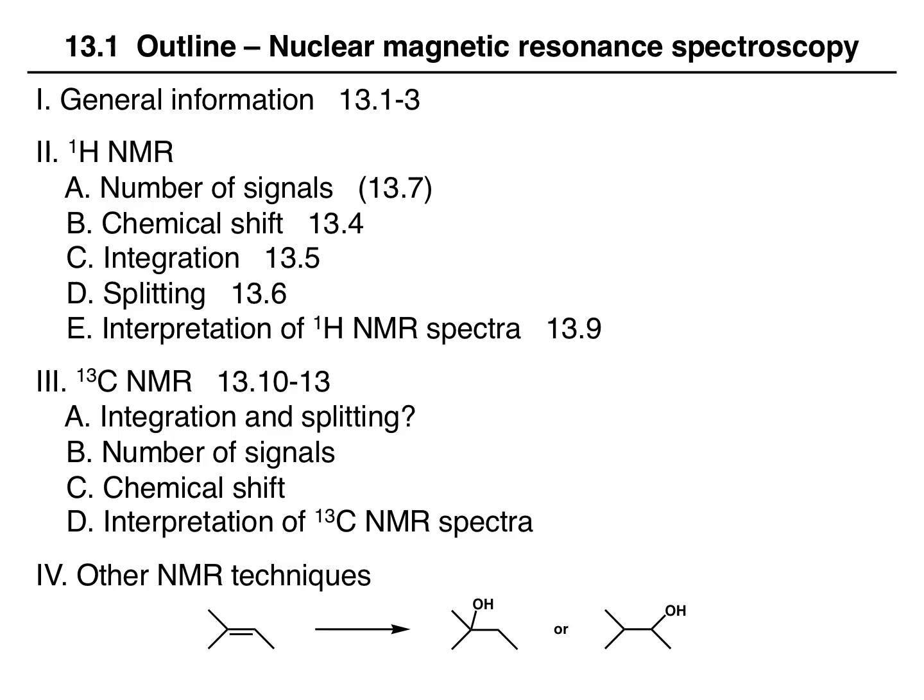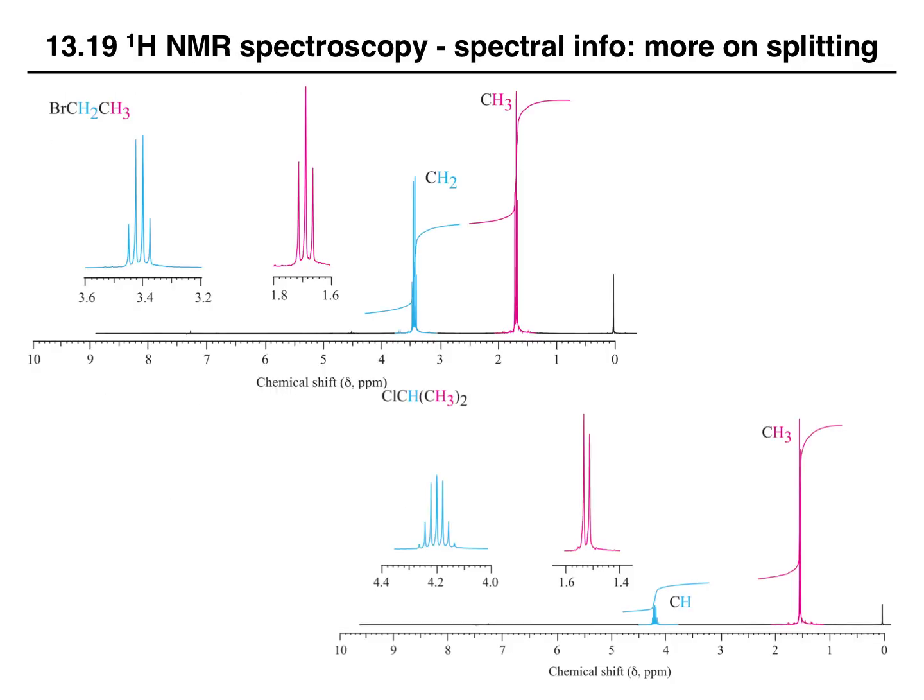In this video, we are continuing our look at proton NMR spectra, and we are continuing to focus on splitting. Next, we will look at some common splitting patterns, as well as some splitting that is more complex. Let's look at a few examples of spectra.